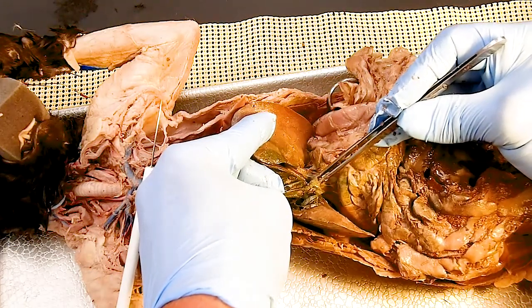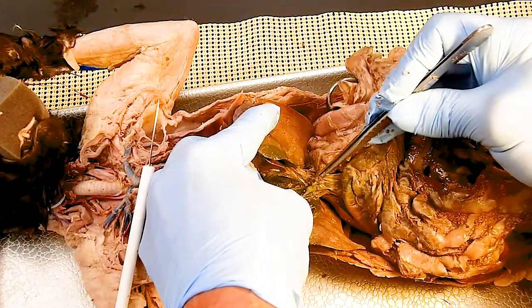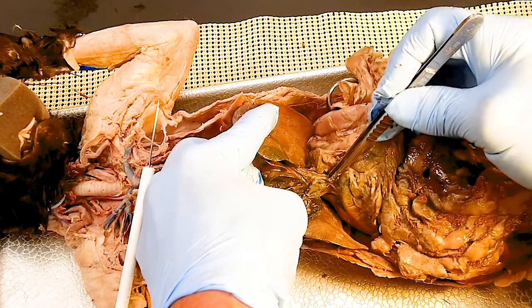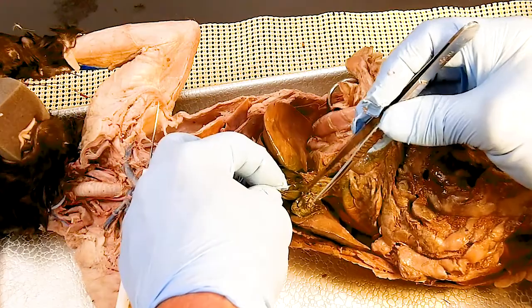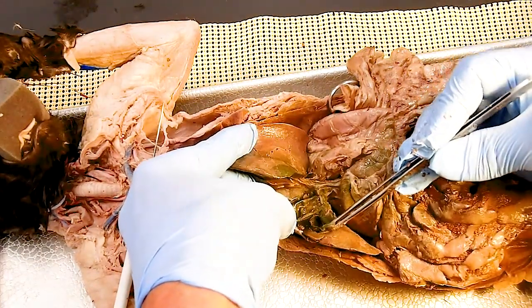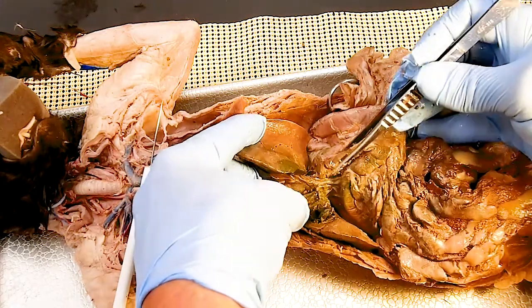Coming out of the gallbladder would have been the cystic duct, and then hepatic ducts coming out of the liver. Common bile duct would be down here somewhere. I don't usually ask those ducts on the cat, but you can see the gallbladder. This one almost looks like it has two. Look at that. It looks like little bunny ears or something. Usually it's just one bag.